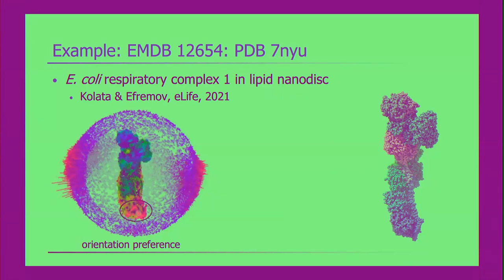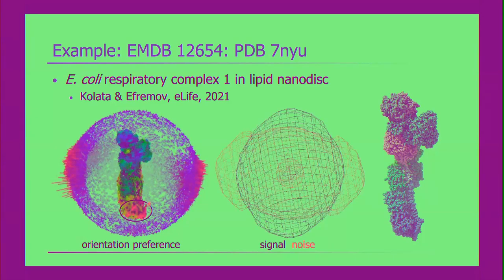This structure, as I mentioned, has a wide variation in resolution from about 3.8 to something like 9 to 11 angstroms. So if we look at this part of the map here, which is the part of the map that I showed you in that earlier slide, this corresponds to one of the chains, chain L of this protein. If we do this analysis for that part of the map and look at Fourier space in the same orientation as the real space, you can see the signal power is anisotropic, as you might expect. The noise power is much higher in the direction parallel to your preferred orientations because those correspond to Fourier terms you're not seeing a lot. So it all makes sense, really.